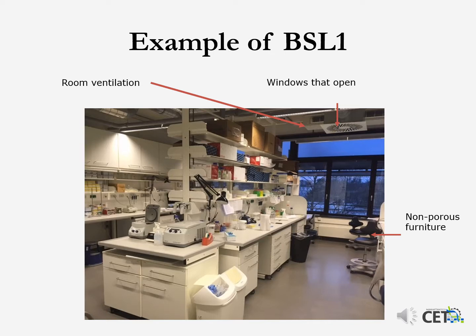This is a picture of a BSL-1 lab, but to be honest, a BSL-1 lab is just about like your kitchen. It has a door for access control. It has a sink for hand washing. All the furniture in that room and in your kitchen are easily cleanable. It has normal construction, no unusual ventilation, no unusual floors, and does not need to be separated from other rooms. Any safety that's needed in your kitchen is the same type of safety that's needed in this lab, and vice versa. Anything they do in that lab, you would be able to do in your kitchen. But that's the type of lab that's considered a BSL-1.